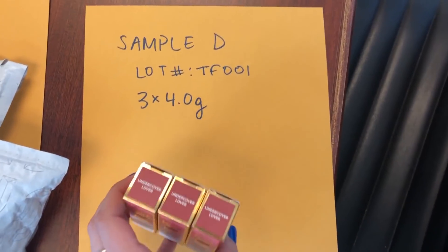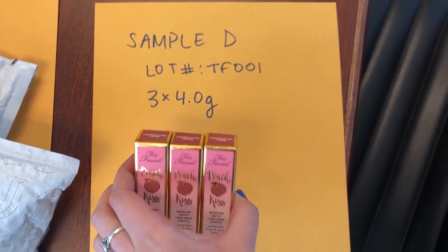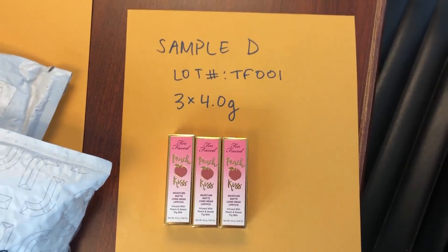One of the control samples I did was a lipstick from Too Faced Cosmetics. The reason I chose this one is because the formula was actually really similar to the Jaclyn Hill Cosmetics lipstick formula. It contained both water-soluble and oil-soluble ingredients and had a very similar type of preservative system, so to me it was a very comparable formula to the Jaclyn Hill Cosmetics lipstick.